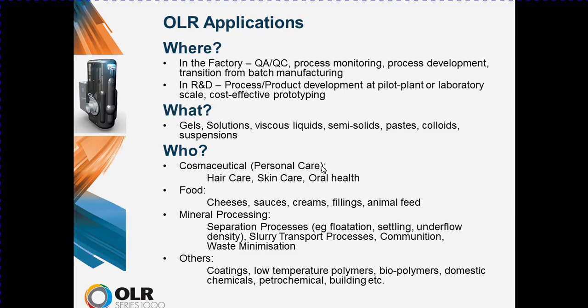In the mineral processing industry, rheology is already widely used, particularly in slurry transport and comminution processes, but also separation processes for flotation and underflow density control. Rheology is already widely used in either viscosity measurements or in yield stress measurements.